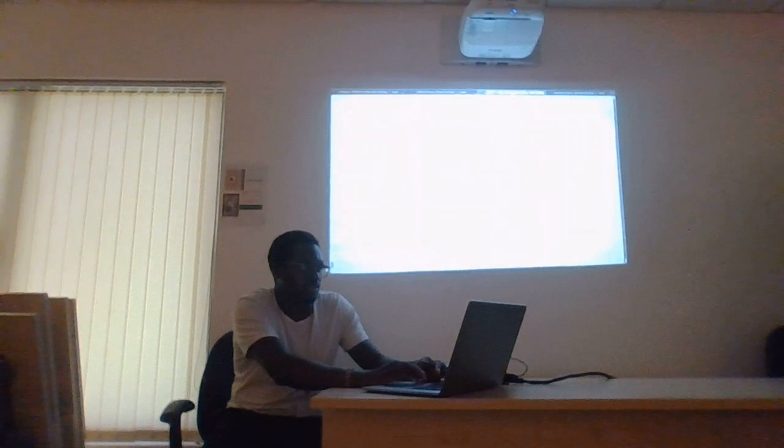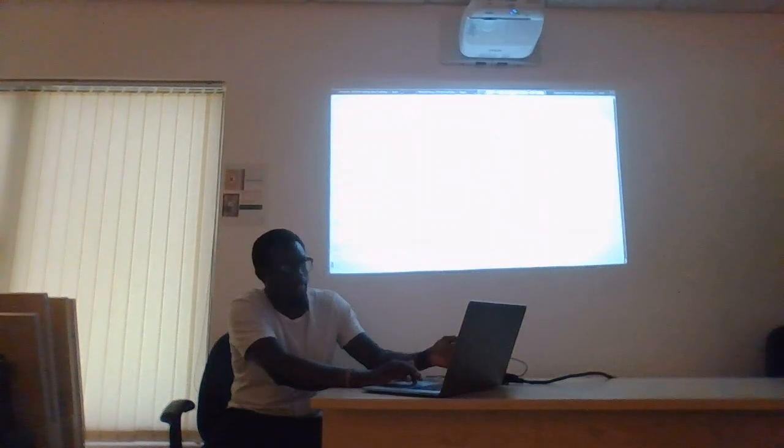These are not the entire values, but it's a long string of values. So if I check in work under this directory, I should be able to see the output of my index process.